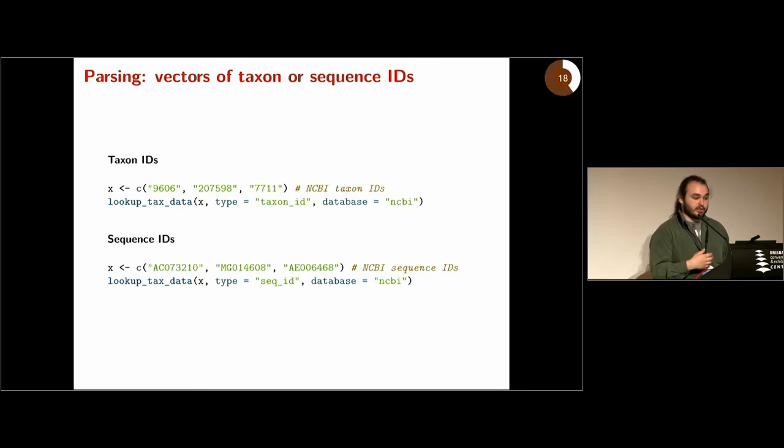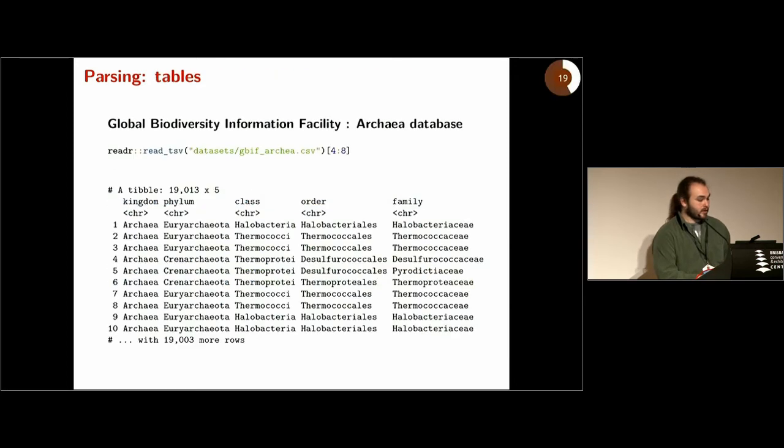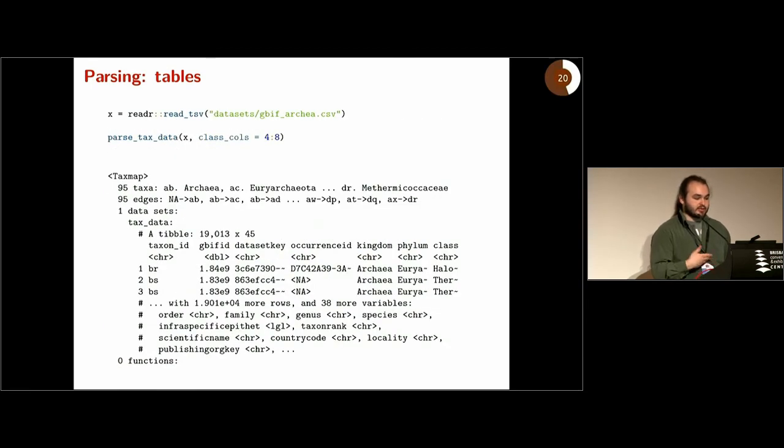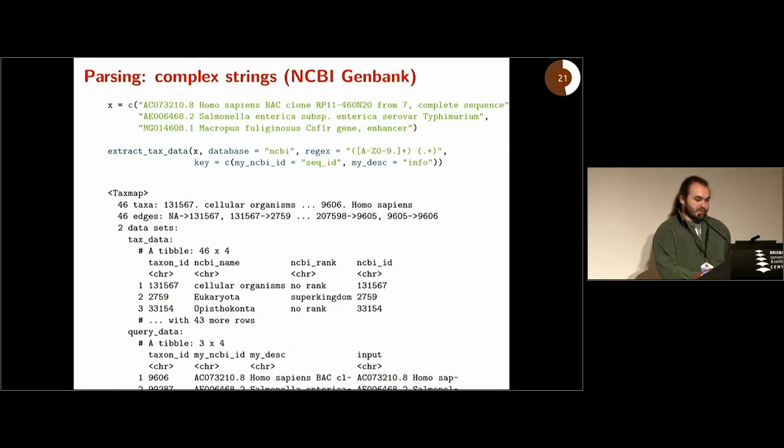It's very similar if you want to use taxon IDs or sequence IDs - I won't show the output, but you just change this type parameter. If you have a table, like this is the GBIF Archaea database I showed you previously that has taxonomic information in columns four through eight, you would use the same function for parsing things that are not online, just define the columns that this information is in. You have the original table here and you have an additional taxon ID column.